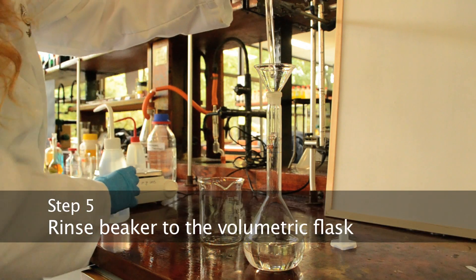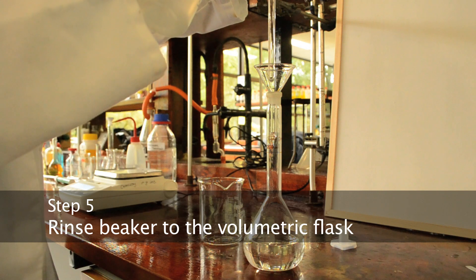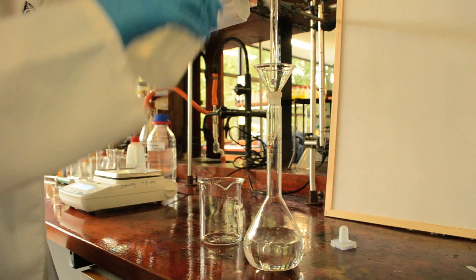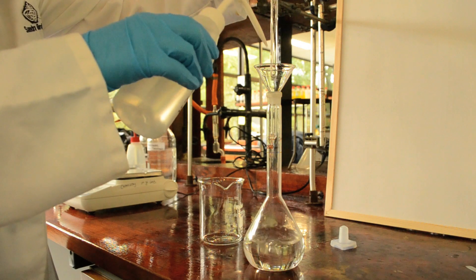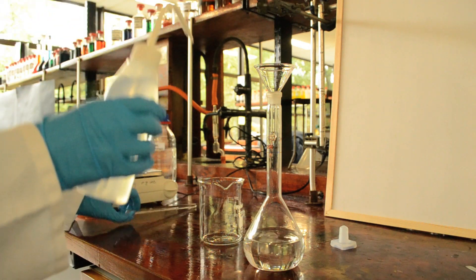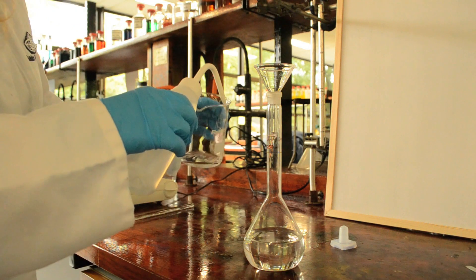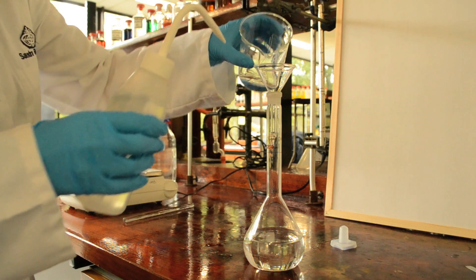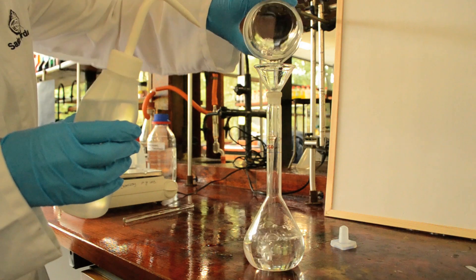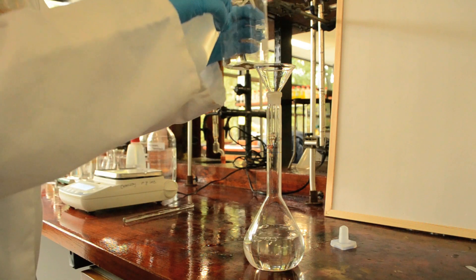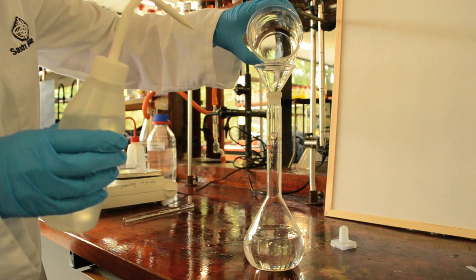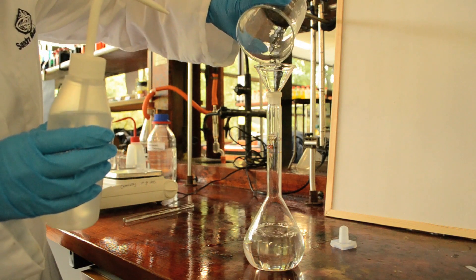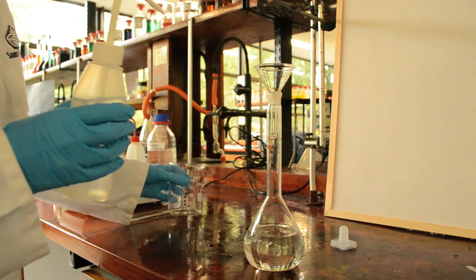Once I've done this, I ensure that every drop of solution makes its way in by rinsing the glass rod and the beaker fully. Now I know the exact quantity of sodium carbonate in the volumetric flask.